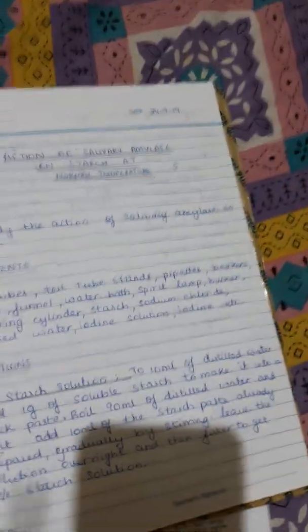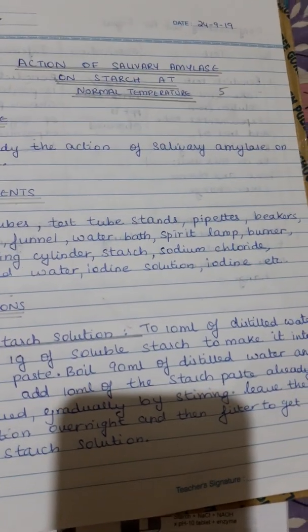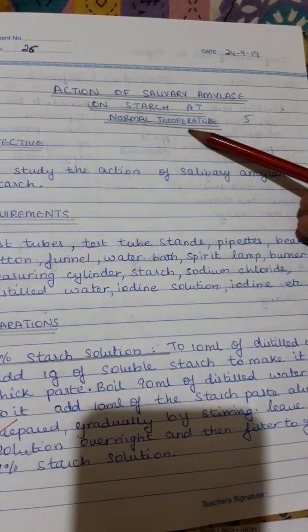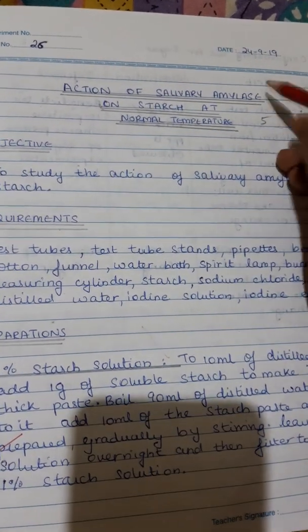But the procedure is not from our lab manual. We have to write the procedure as separate experiments. That means we have to write this experiment as three parts. The first experiment, fifth one, is at normal temperature, that is 5A.